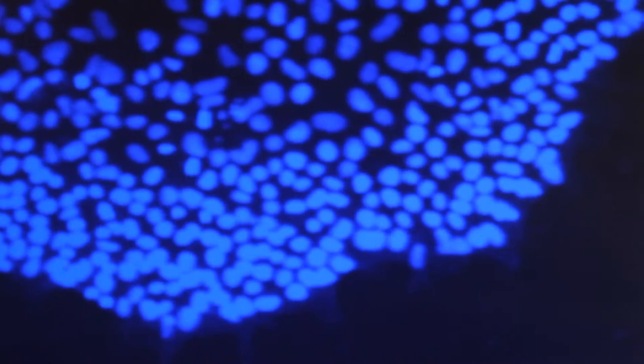People think it's magic, they think it's magnetic, they think it's some sort of electronic system. They're able to move the stage just a few microns at a time because of the technology we put in. On a traditional microscope you'd put a sample on and try to adjust it a little bit and you'd see your image just slide way off the screen.